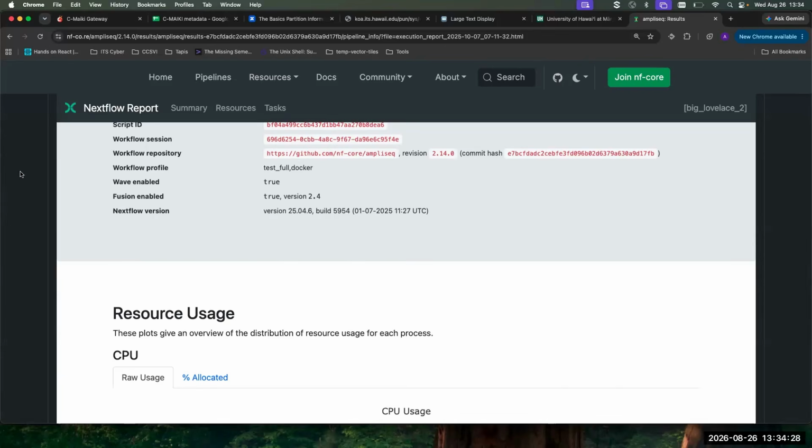Okay. So every time you use the gateway, there'll be three things you have to cite: the gateway itself, the pipeline you used, and the parameters you used. And for the parameters, you probably either want to specify them yourself, or if you're essentially using default parameters, we'll have a couple papers listed that are basically pretty similar to the default parameters. Do you know of any other paper that we have for the ITS? I think Leah Thompson's paper is the one for the ITS pipeline.